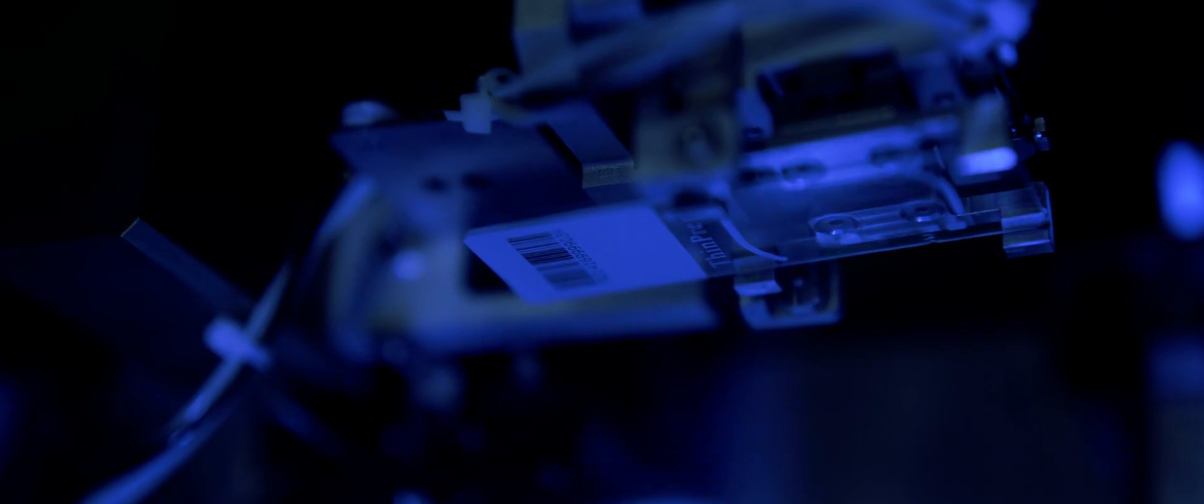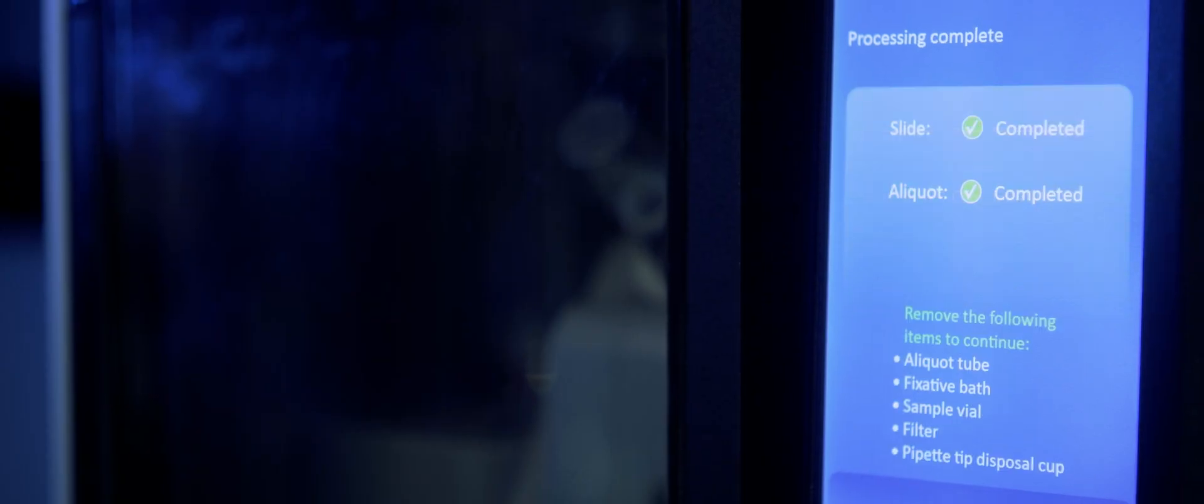Through its automation and ergonomic benefits, the simple, compact, benchtop package frees your team from repetitive strain and empowers them to accomplish more in their day, making it an indispensable seamless addition to lab workflows.